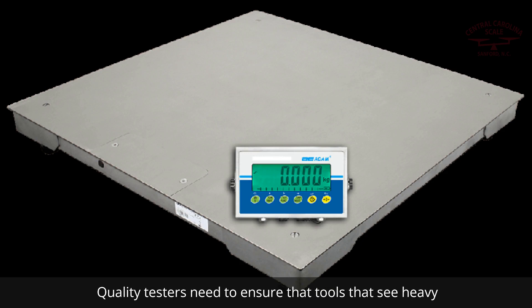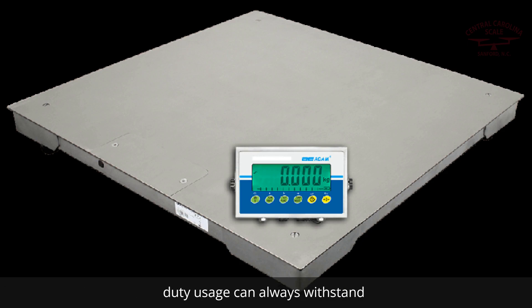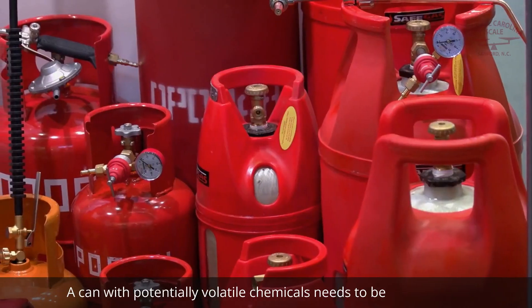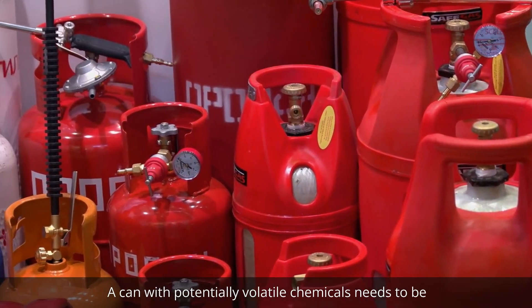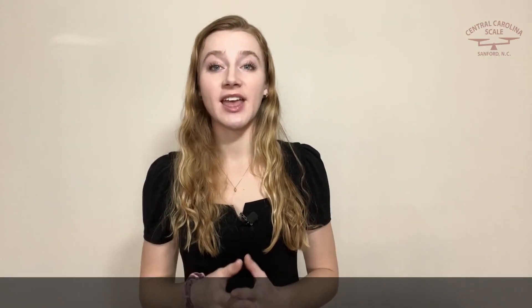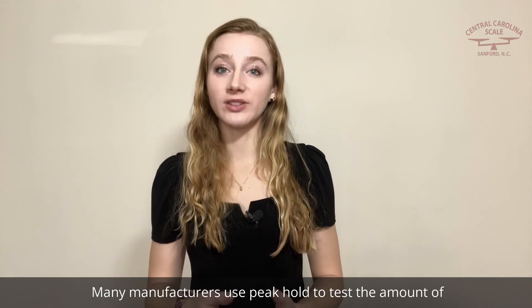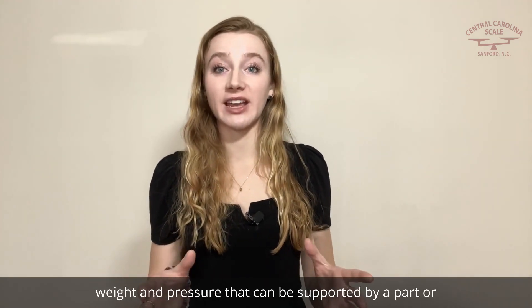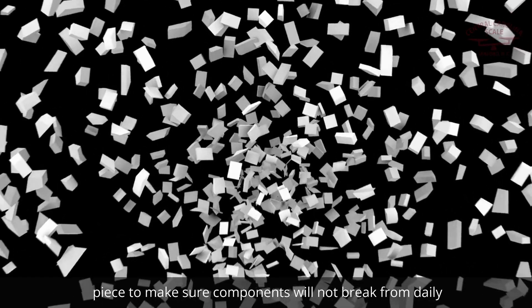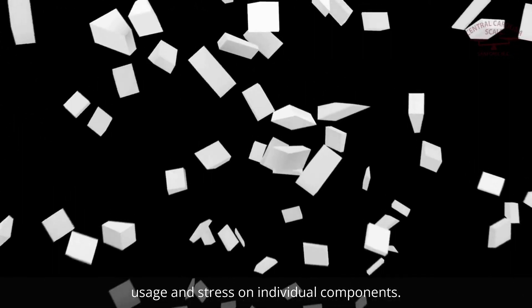You probably would not buy that brand again. Quality testers need to ensure that tools that see heavy-duty usage can always withstand daily usage without breaking randomly. A can with potentially volatile chemicals needs to be made of a material that can withstand a certain amount of pressure build-up before it breaks, or people could get injured. Many manufacturers use Peak Hold to test the amount of weight and pressure that can be supported by a part or piece, to make sure components will not break from daily usage and stress on individual components.